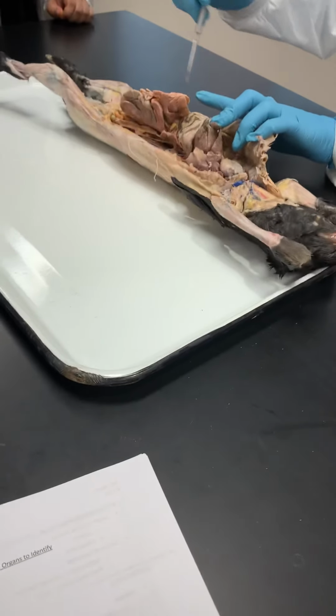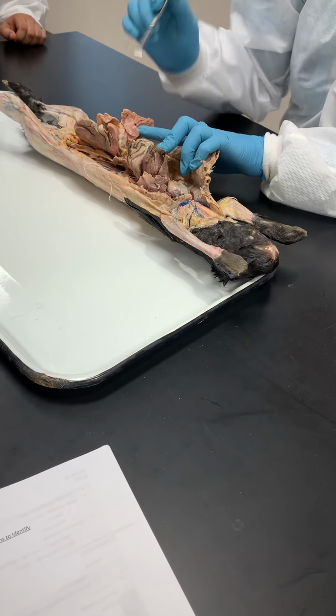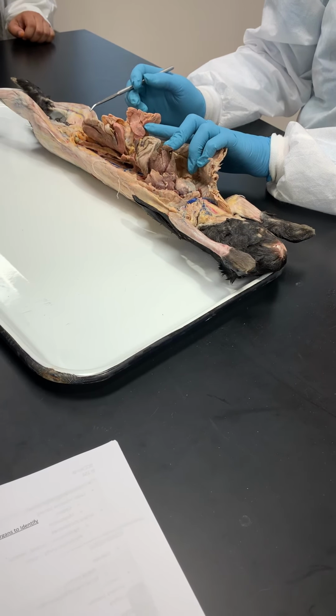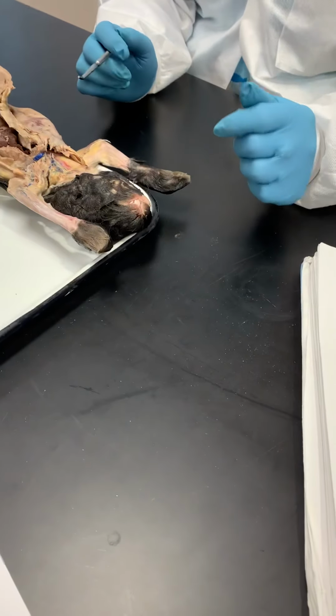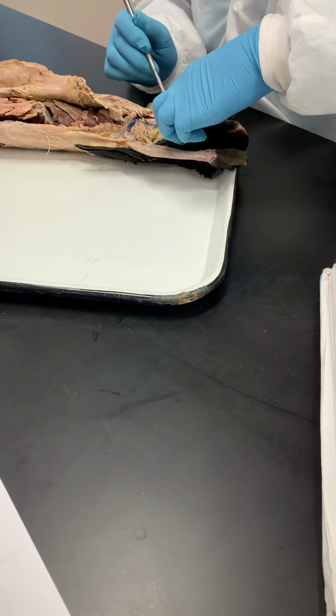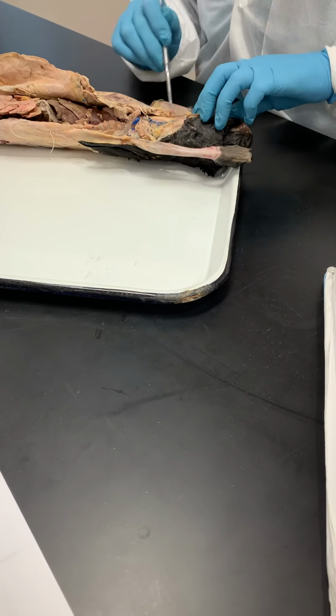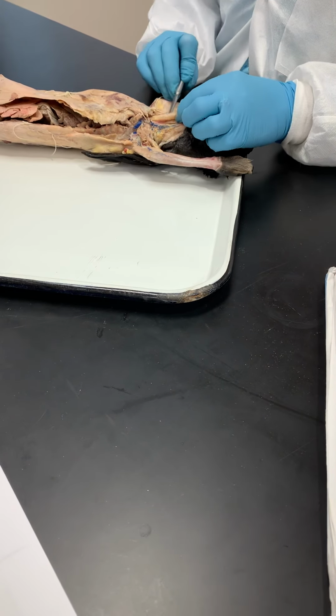In a cat, it's huge. It's like Mick Jagger's tongue. Here, it's little. Okay. And then we have respiratory stuff. You know where the nostrils are. The larynx. Let's get the larynx exposed a little bit better. See the trachea? The C rings right here?